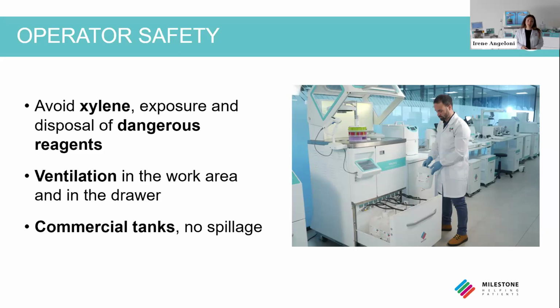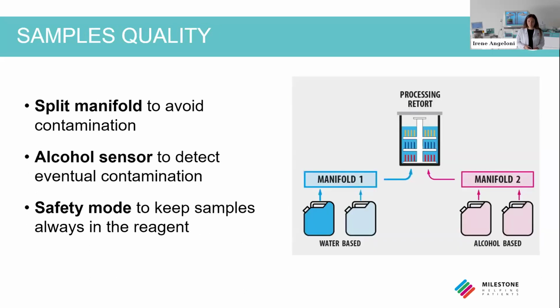Now, regarding the sample quality, so we've seen the safety of the operator and now sample quality. This is a very important point because the reagent at the end is what, let's say, transforms the tissue.